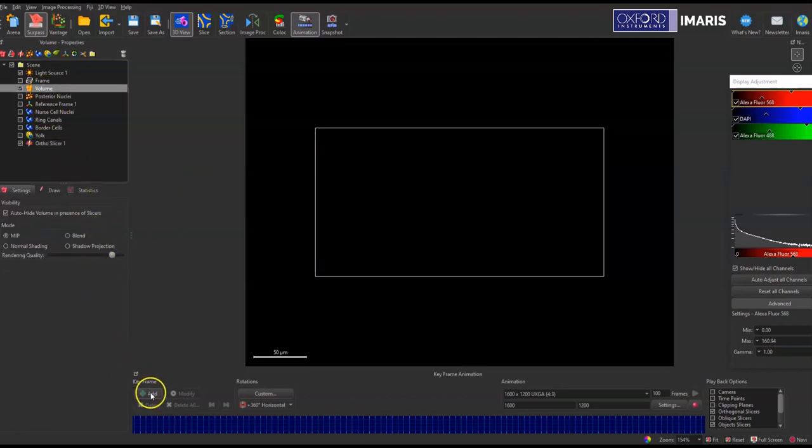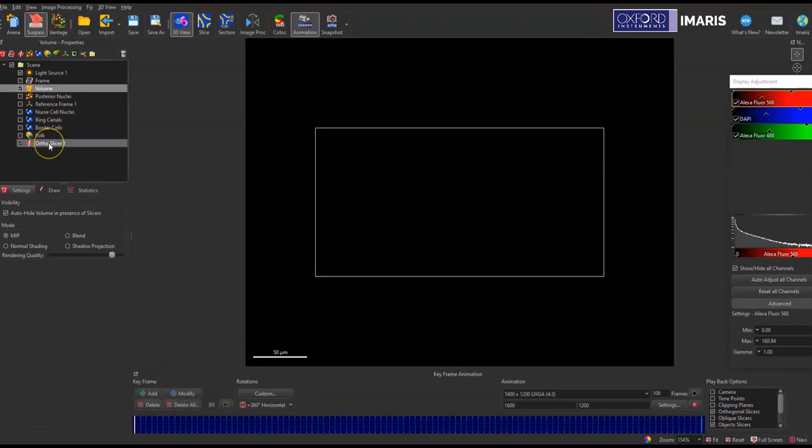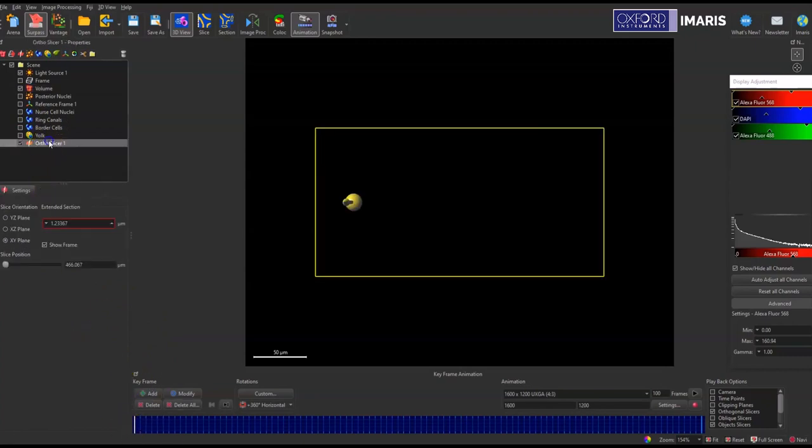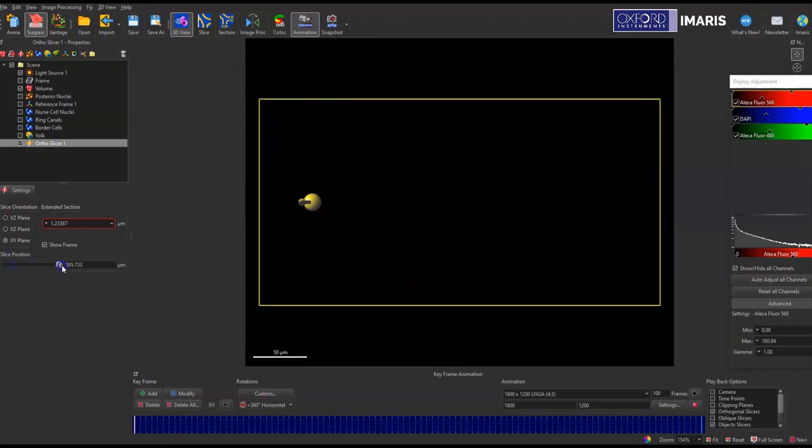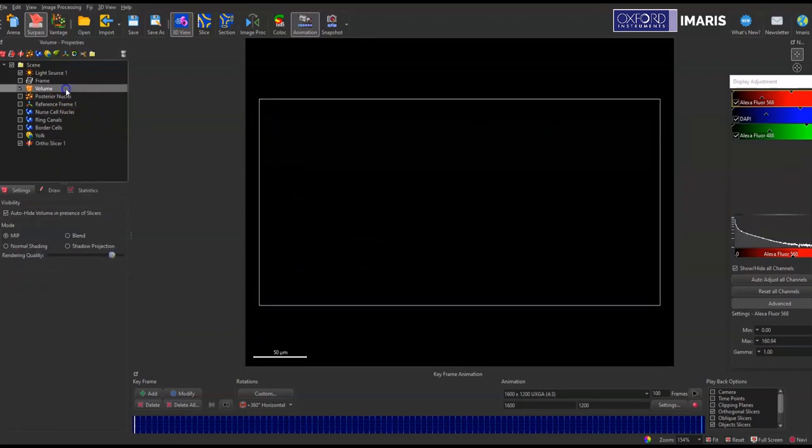And then I'm going to add a key frame. I want to start at the bottom of my ortho slicer at a key frame. So I'll go back to my ortho slicer, slide down and through the Z stack. So I'm at the top of it. Once again, click on volume again to remove that ortho slicer and then add that final key frame.